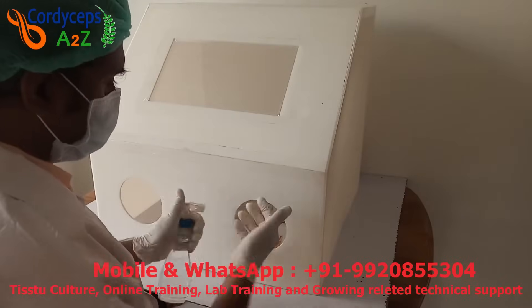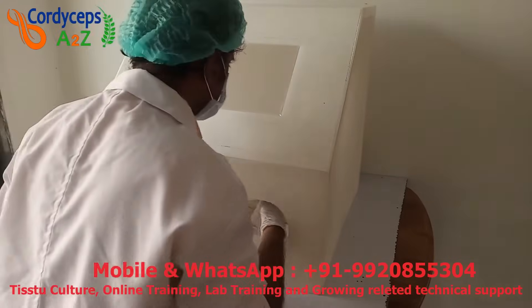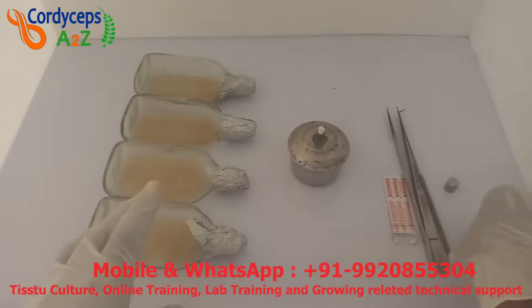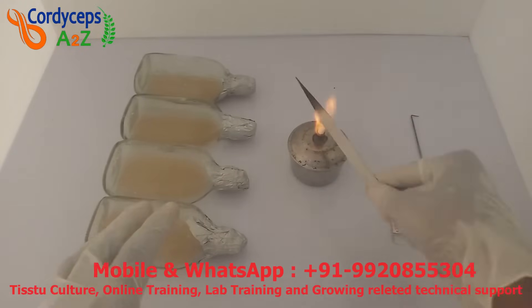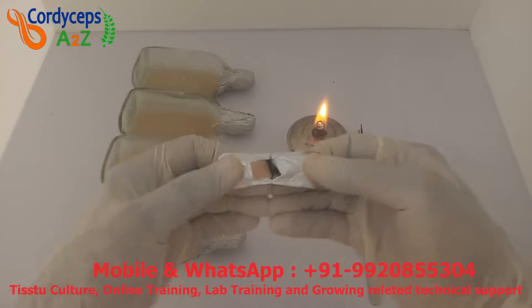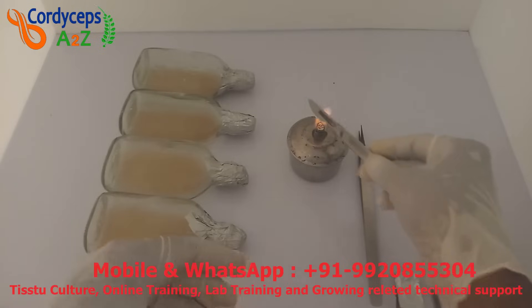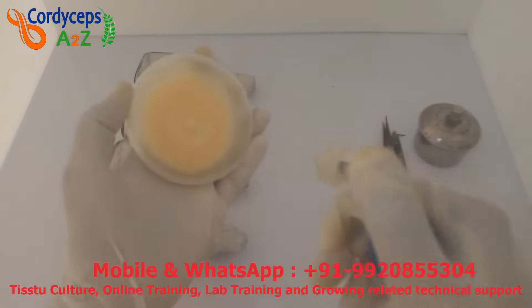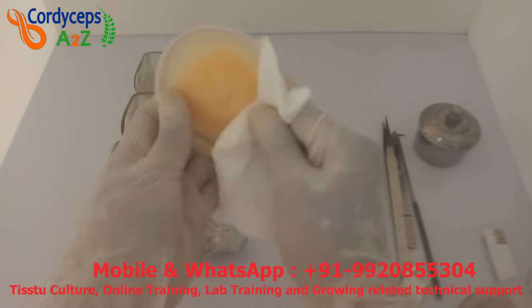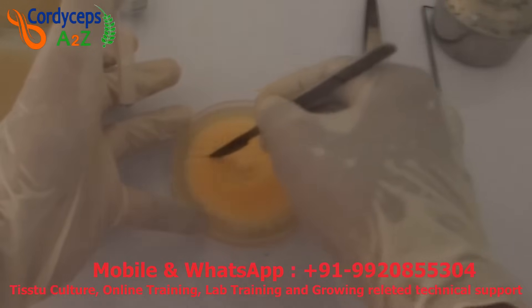Now we will work on sterile media. We have to work wearing only a lab coat, mask, gloves and cap, and clean our hands with isopropyl alcohol. We always use isopropyl for all cleaning purposes. After that, heat all the equipment on the spirit lamp. Whenever using a surgical knife, put a new blade in the knife. Now clean the petri dish of tissue culture with isopropyl alcohol.